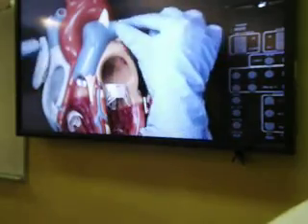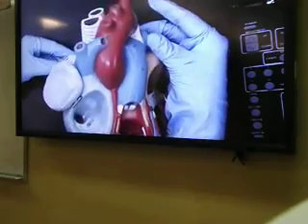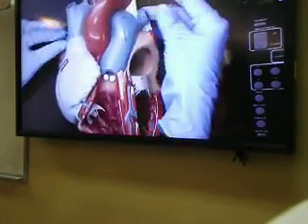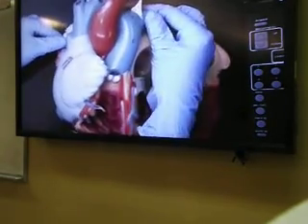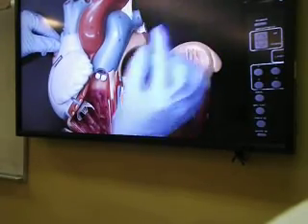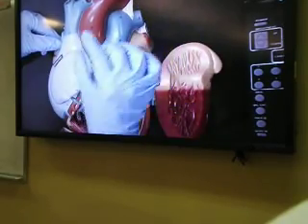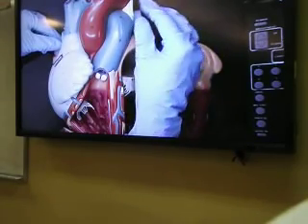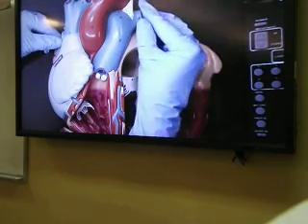The pulmonary trunk ultimately will split into 2 parts: on the left side, the left pulmonary artery, and on the right side, the right pulmonary artery, to take the deoxygenated blood all the way to the lungs, where oxygenation of our blood will take place in small blood vessels which we call capillaries, where the oxygen that we inspire will be diffused into our blood, and CO2 will be diffused out.